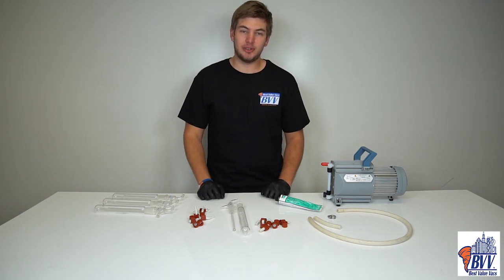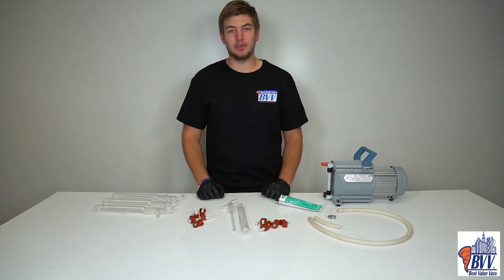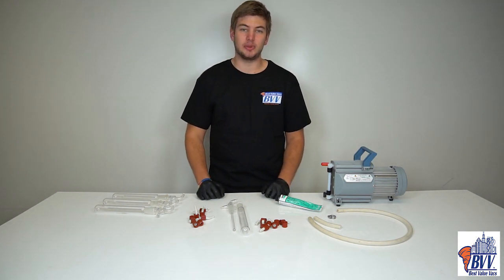Hi everyone, we're here at the Best Value Vacs testing laboratory today. This video is a short tutorial on how to hook up your vacuum cold traps.